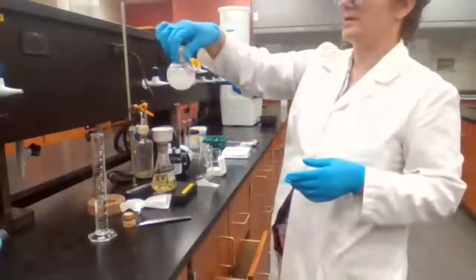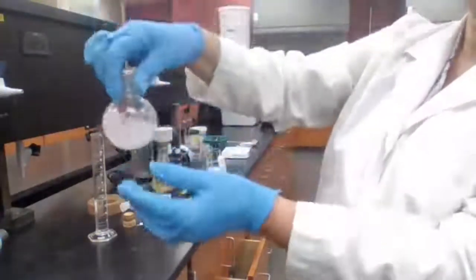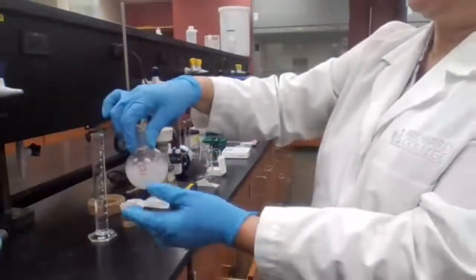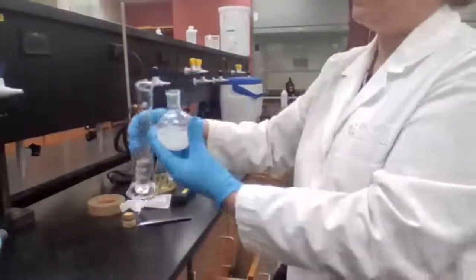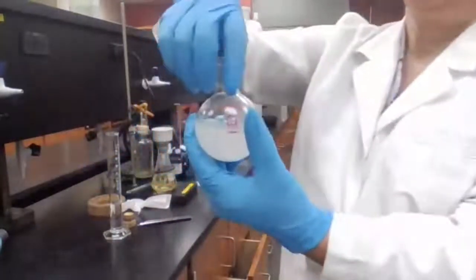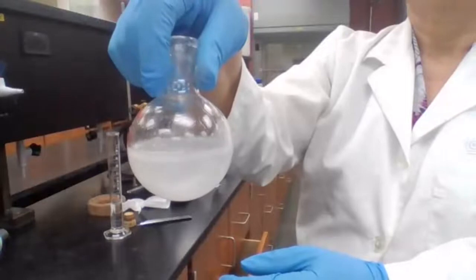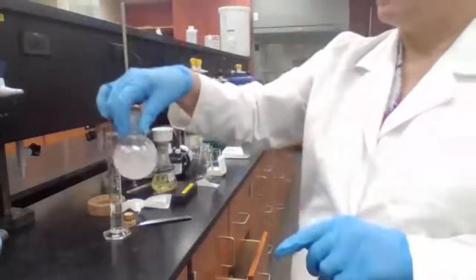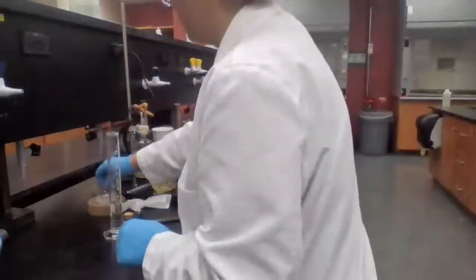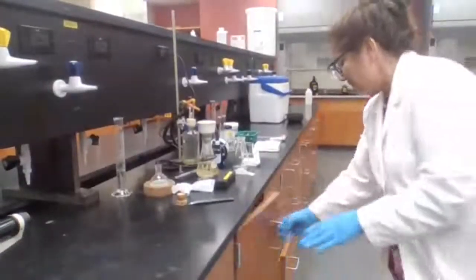But first, I'm going to try adding the sodium hydroxide and looking for the second layer. Okay. Do you see an oily ring on top? Yes? Okay. So we have the second layer, and as soon as we have the second layer, I can go ahead and set up distillation. You have to set up the simple distillation.